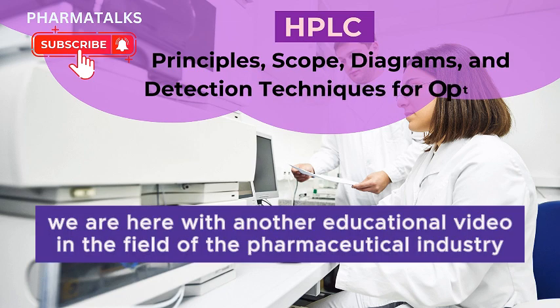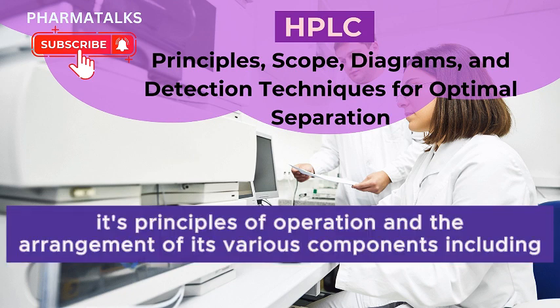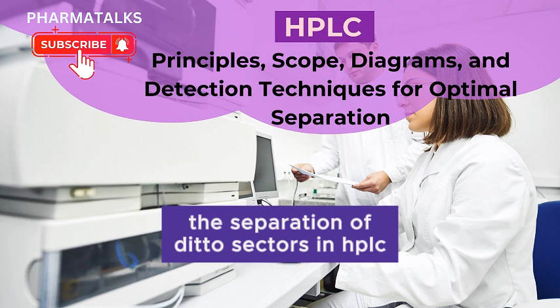We are here with another educational video in the field of the pharmaceutical industry. This video is about the HPLC device, its principles of operation, and the arrangement of its various components, including the separation of detectors in HPLC.